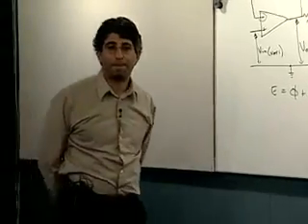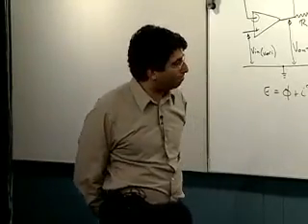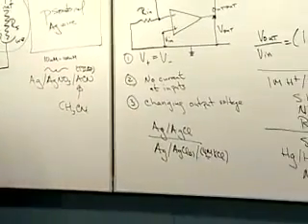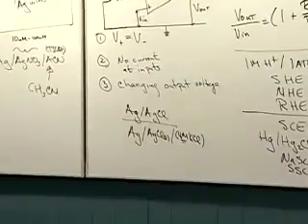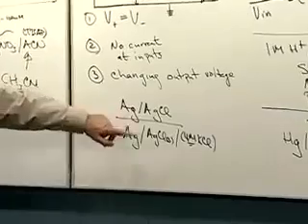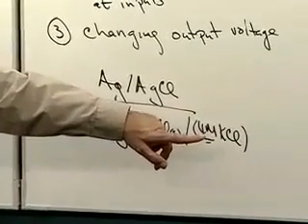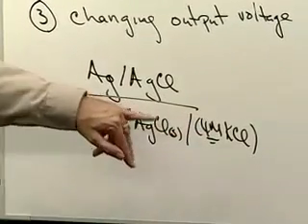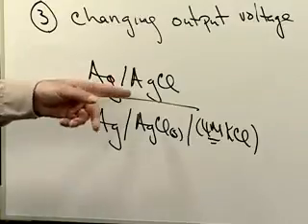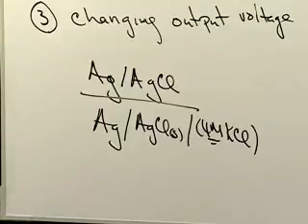Do you have a favorite reference for people who want to make their own reference electrodes? This one is the easiest one to build. The silver chloride is the easiest reference electrode to build if you want to do a homemade one. What I would do is take a silver wire and put it in your 4 molar KCl, or maybe if it's home built, you'll want to use saturated KCl here, break with convention. And then I just pass a little oxidizing current that will oxidize some silver ions, which will cause silver chloride to precipitate on the silver wire, and you're done.